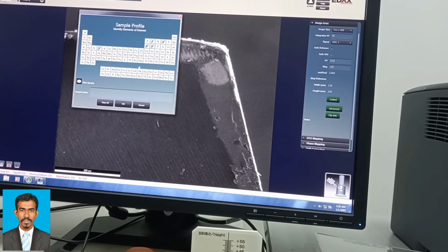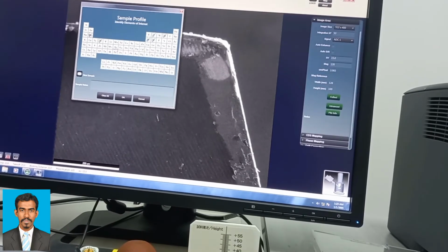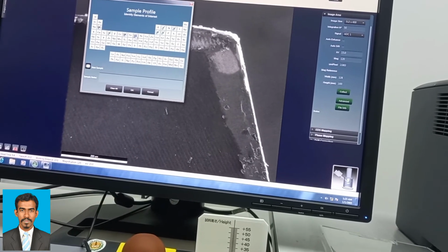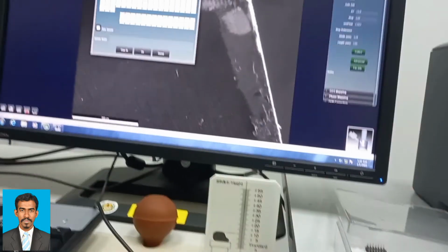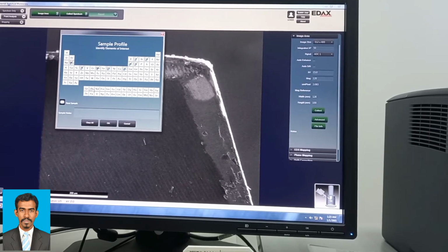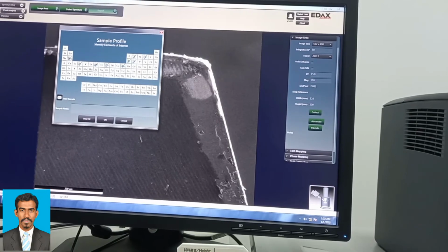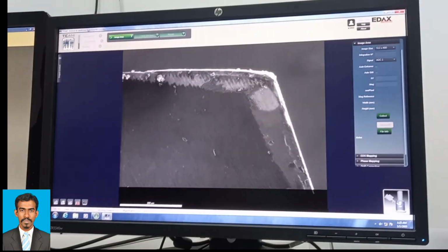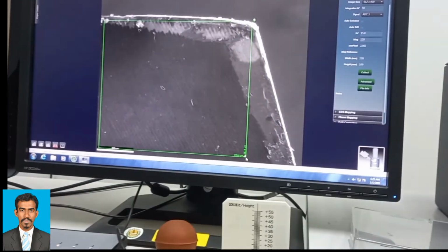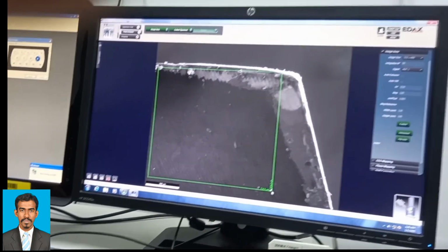So it will show the periodic table. We can select one by one. Here in my case I need titanium, magnesium, manganese, aluminium, carbon, cobalt, silicon, etc. It does not mean that it will show only the elements which we select, but it will show the elements which we select as well as the elements which have nearest energy beside the elements we select. To find the elements, either we can select an area or we can select particular points. Both will work. This setup is available on the top, as you can see here.